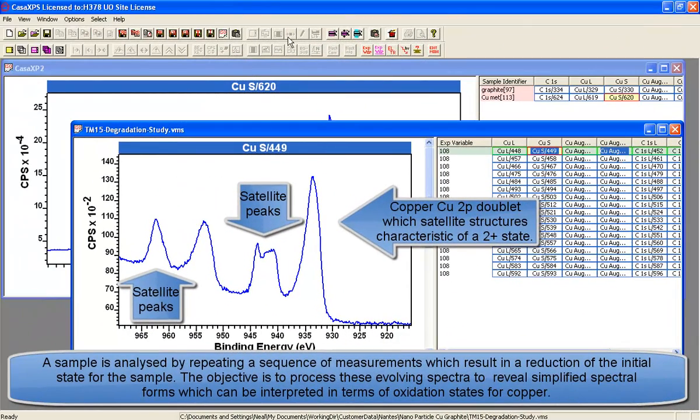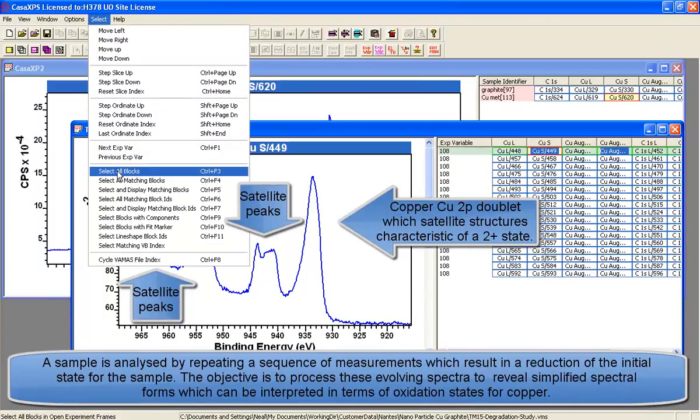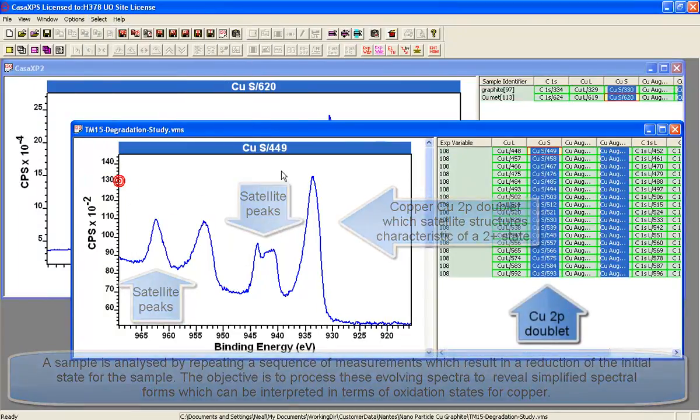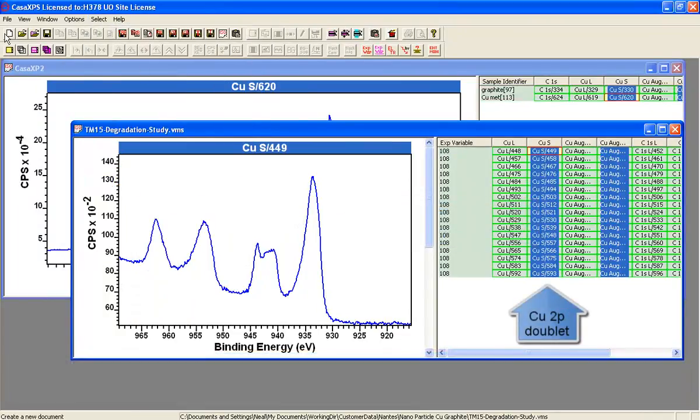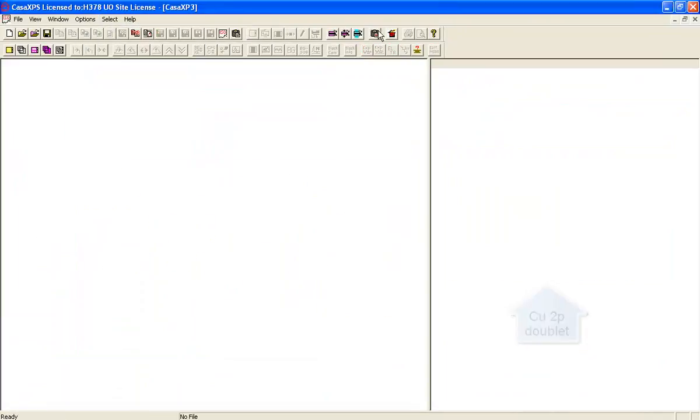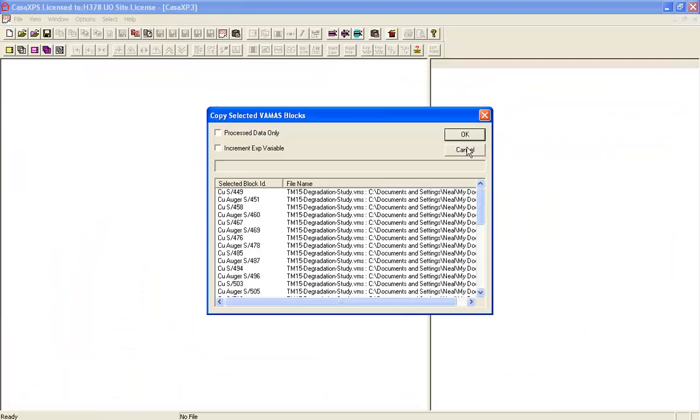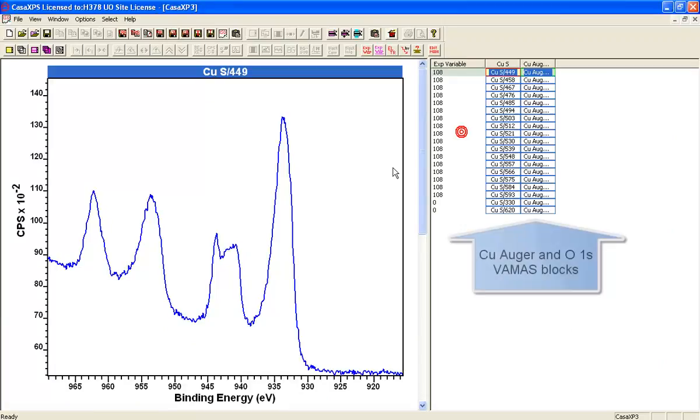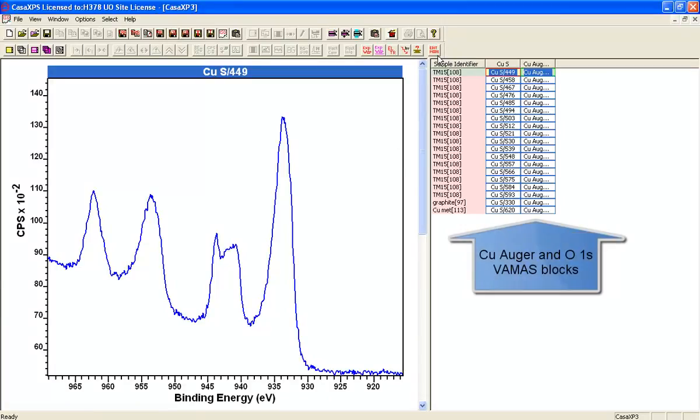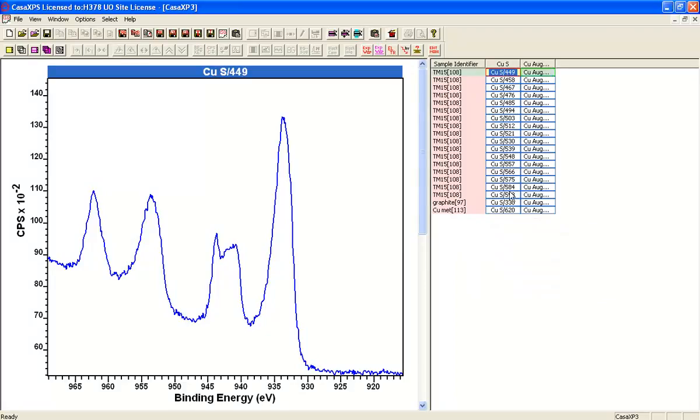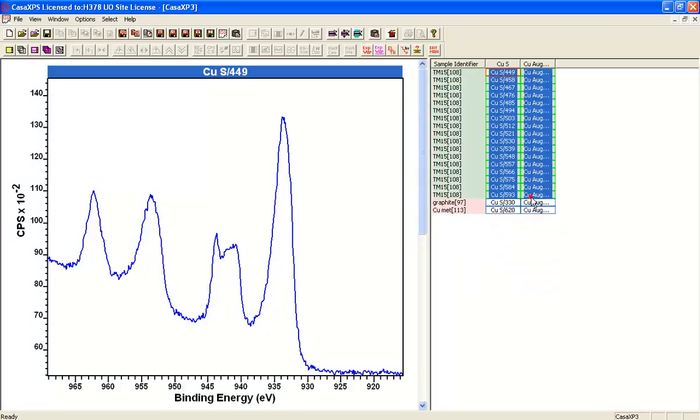In this experiment, the same sample has been measured multiple times. The idea is by measuring multiple times, we can see the data evolve as the x-rays and the measurement process causes a reduction of copper 2 plus oxide.